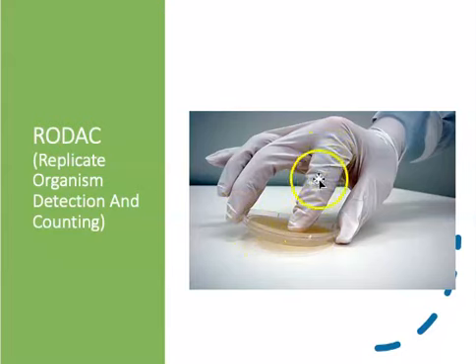And what the person can do is gently bend the plate, you can just see it in this image, to cause the agar to sort of pooch out a little bit, and where it can be pressed against a surface. The person gently pushes the agar down against the surface. The agar will essentially stick to any cells that might be present.